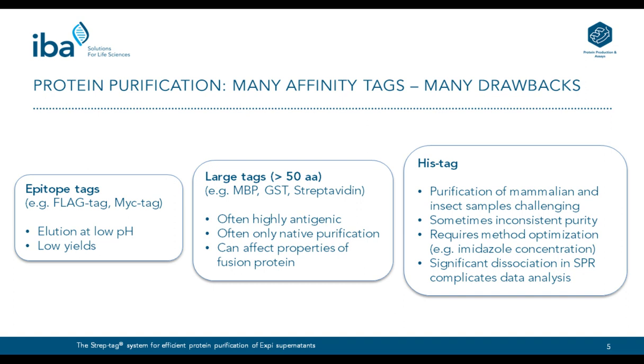Furthermore, the tag system often needs a kind of optimization, for example, the optimization of the imidazole concentration in the sample or the wash buffer, in order to get a good compromise between purity of your protein and protein yield. And finally, the binding affinity of the system is not high enough to really efficiently use it in immobilization experiments like SPR studies, because you can see a remarkable dissociation of the tag itself, and that complicates the data analysis.